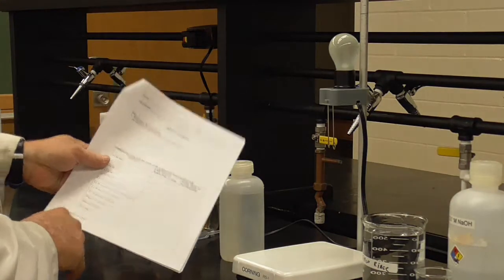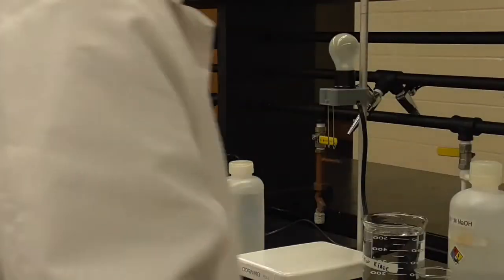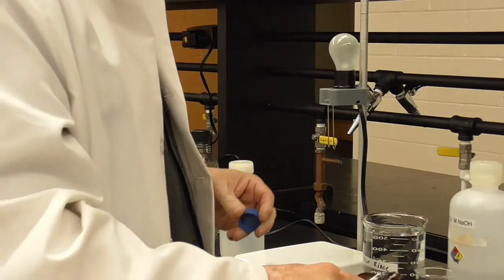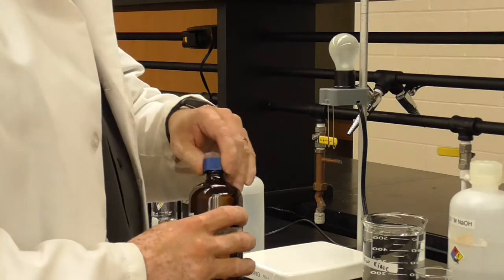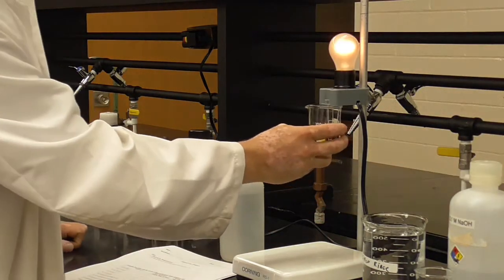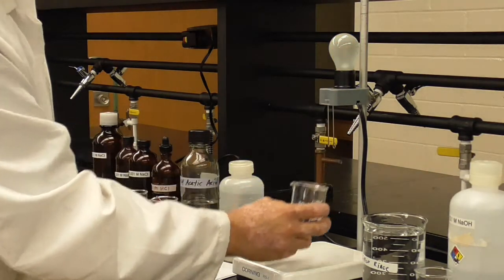Finally, our last two, deionized water and tap water. We all know, don't take your hair dryer in the bathtub with you, right? You're going to electrocute. But here's tap water. Right from the taps of Abilene, Texas. Tap water. Up it goes. And you can see tap water is definitely conducting that electricity really well.